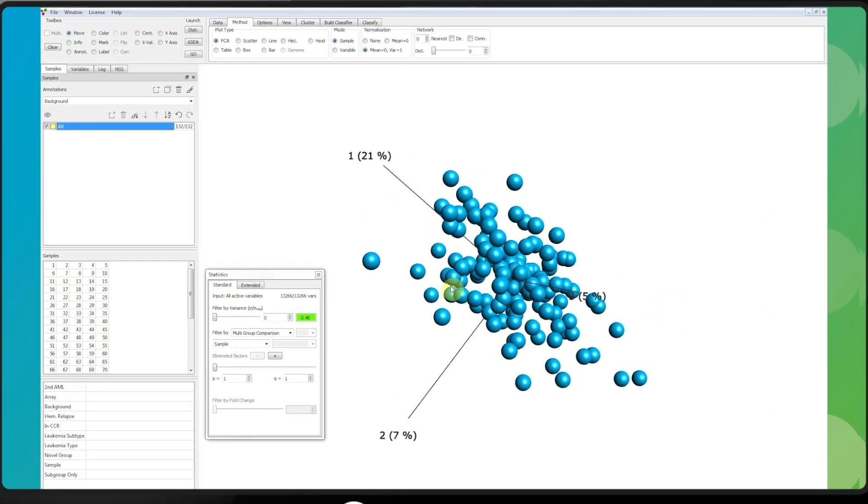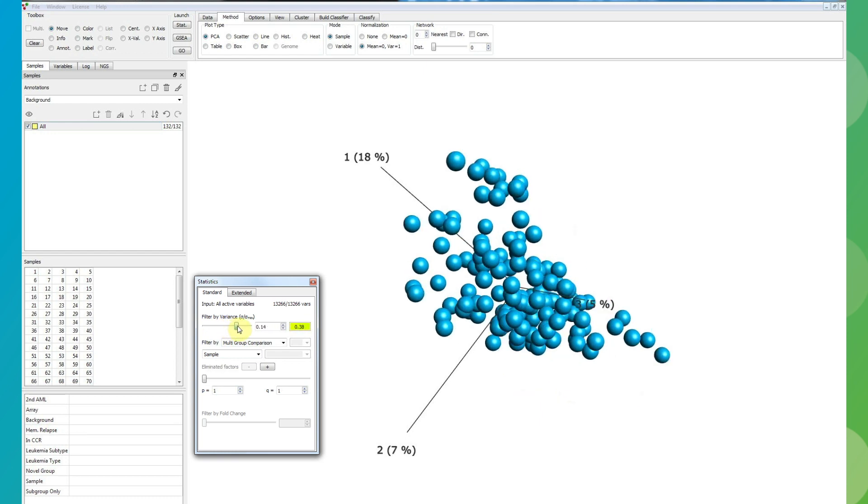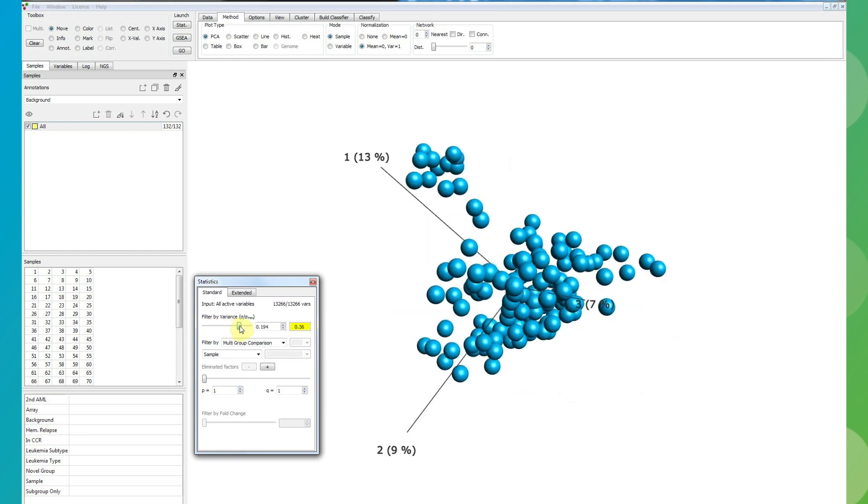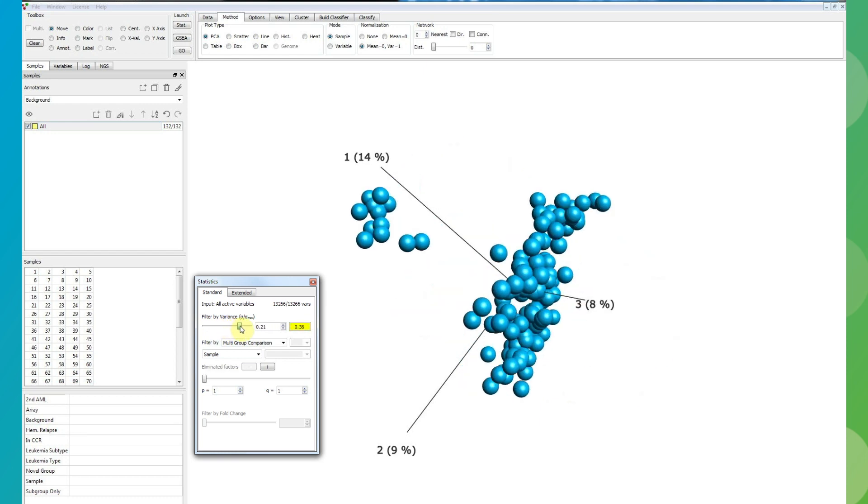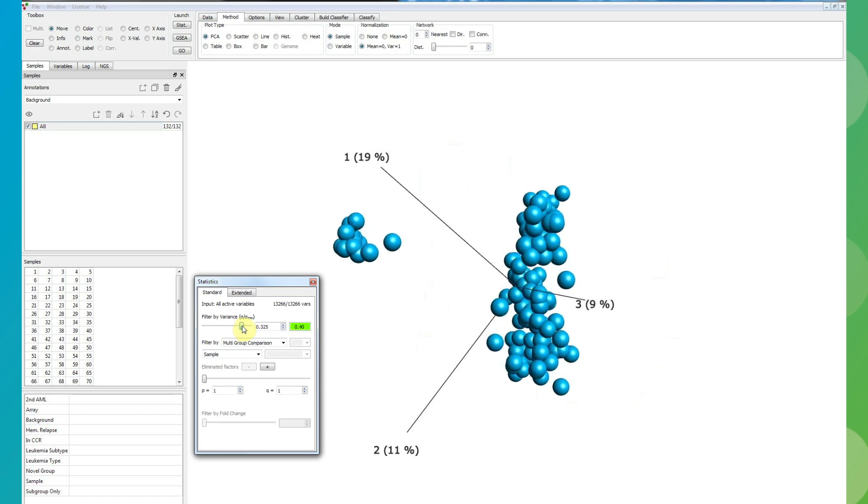ClucorOmics Explorer includes powerful methods to quickly explore large datasets. The fast generation of PCA plots in combination with a projection score metric allows fast discovery of groups and dominating patterns.